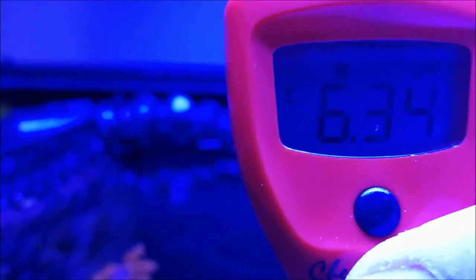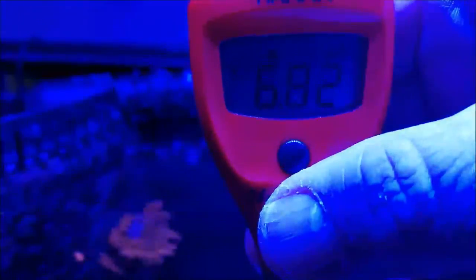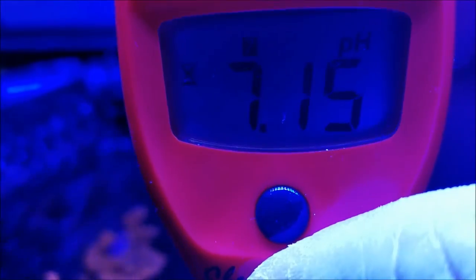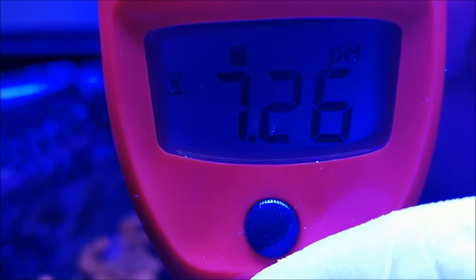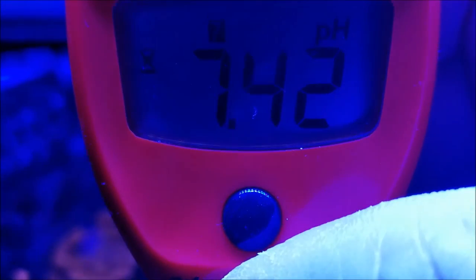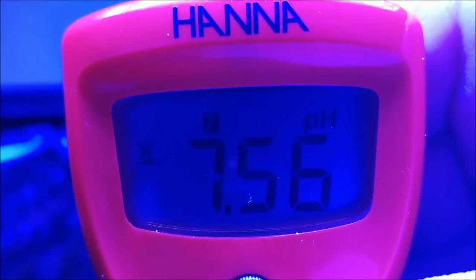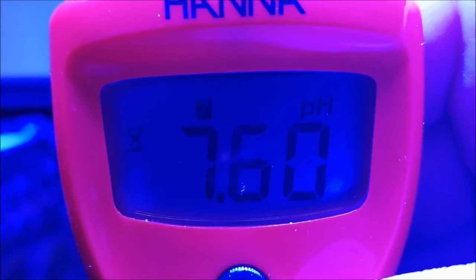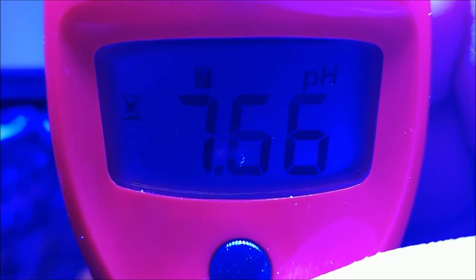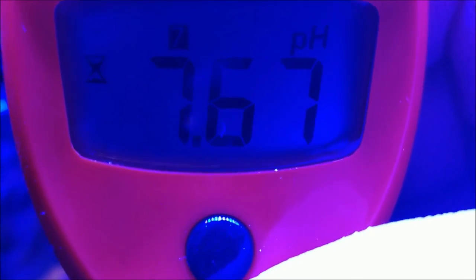So here we are at the tank. I've turned the pH checker on and inserted the tip into the water. Now the checker is going through its measurement process — you can see the hourglass showing that it's running. This is going to take a little bit, so we'll come back when it gets close to its reading and resume.